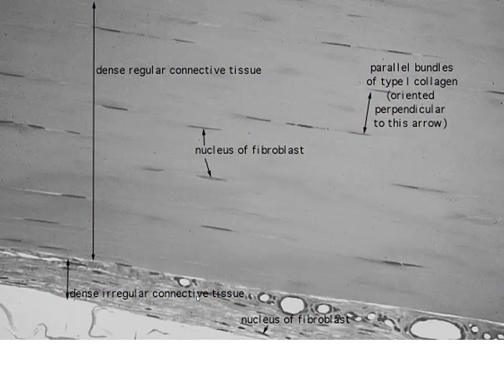And as we get toward the periphery, this is our dense irregular. You see the white spaces, and it appears to have a pattern to it. These are mostly parallel, but again, you see more of that white space. It's not as compacted. Our dense regular connective tissue is ligament and tendon. It's going to look like this. Any space, even if the fibers are somewhat more parallel, then we're going to have dense irregular connective tissue. A lot of blood vessels interspersed in that as well.